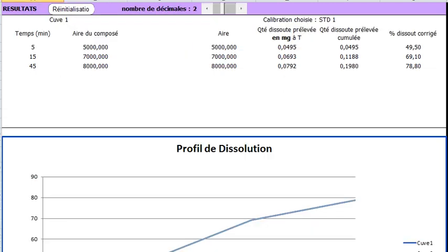Now we fill the form with the areas or absorbances of the samples. The vessel 1 is the only one displayed. Here we enter the areas: the first term, the second one, and the last at 45 minutes.